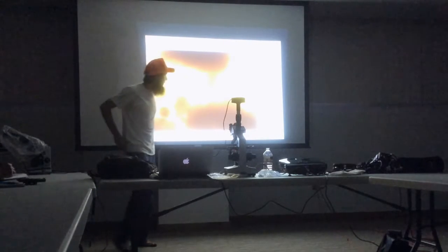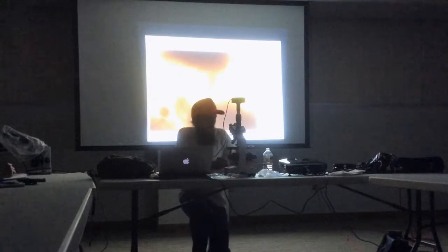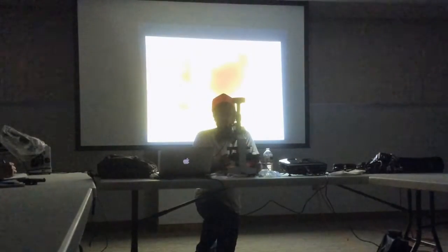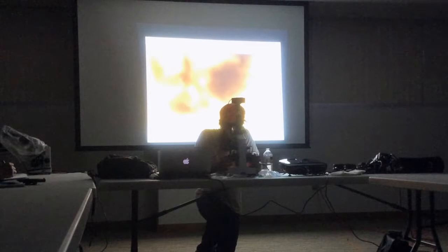This thing's moving. See, moving. Try to just go to some random spot. This was your soil sample, not your IMO? Yeah, no, this is a soil sample. It's from an area that I just put IMO on about a month ago. So it's good to see out there.